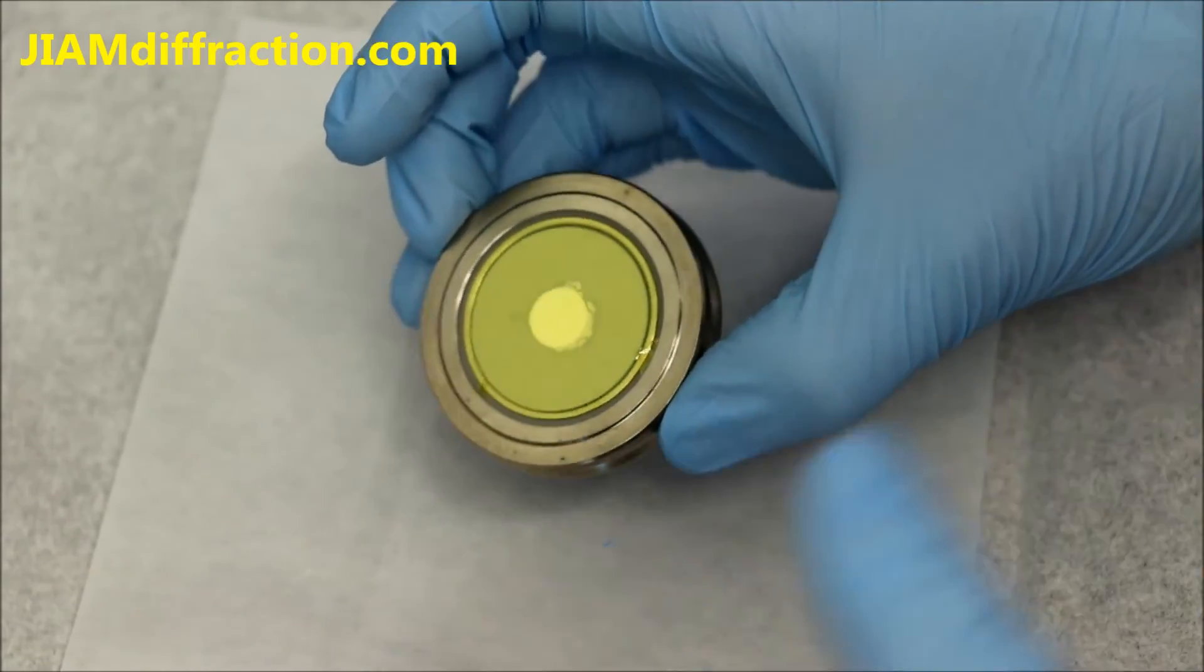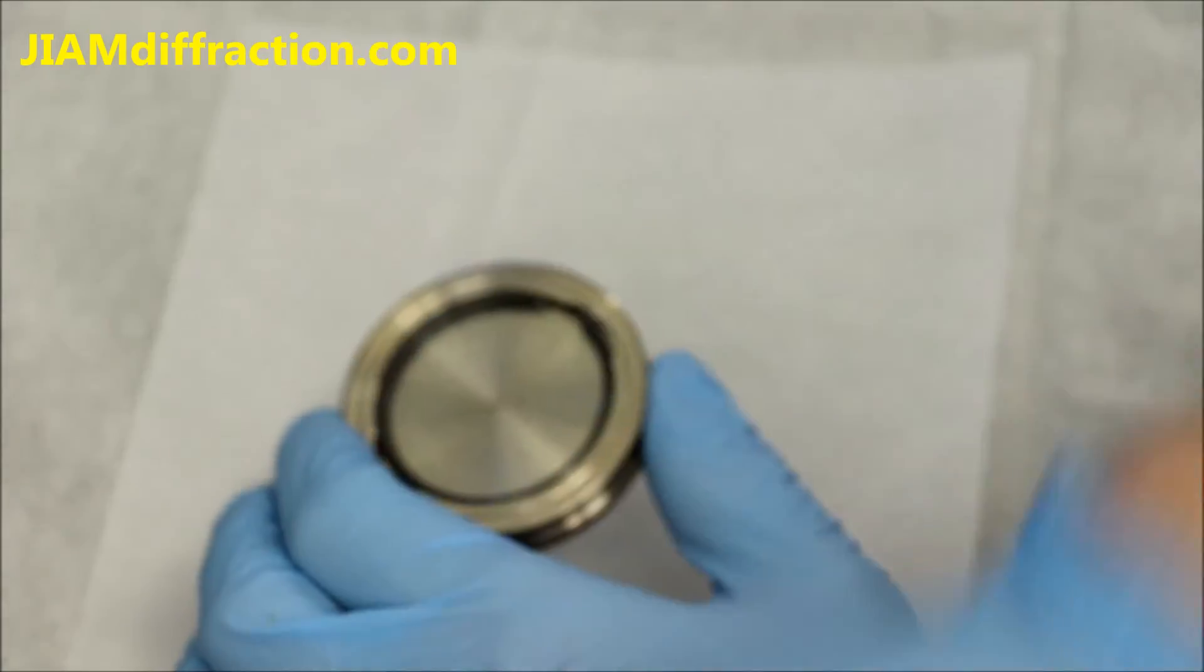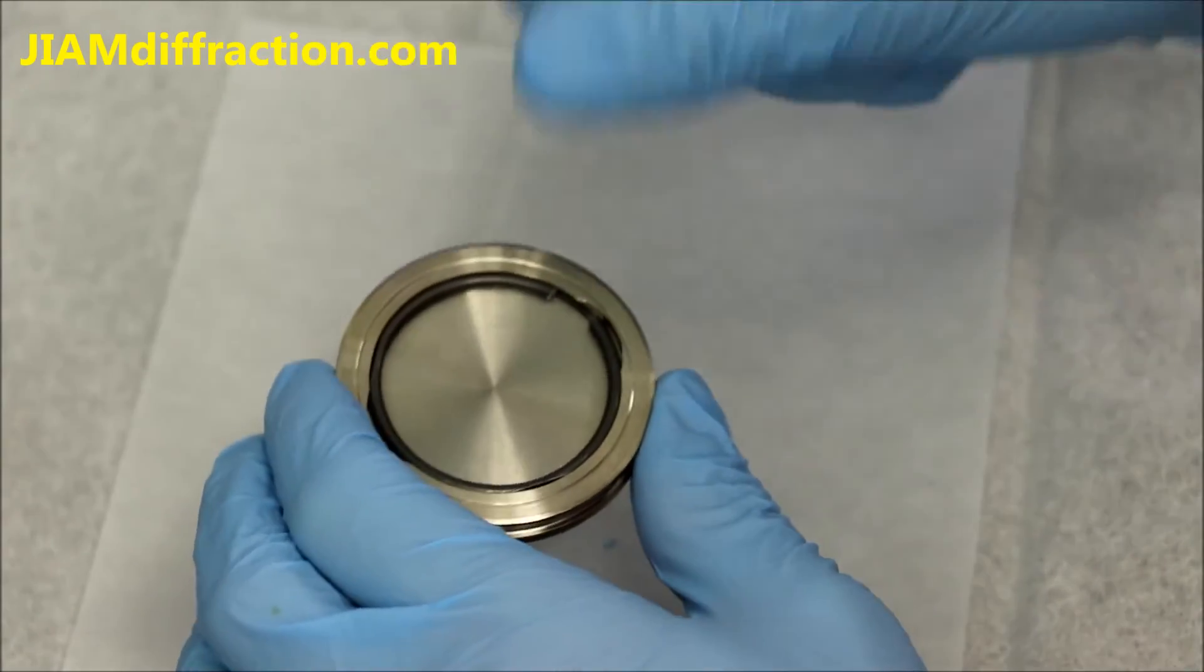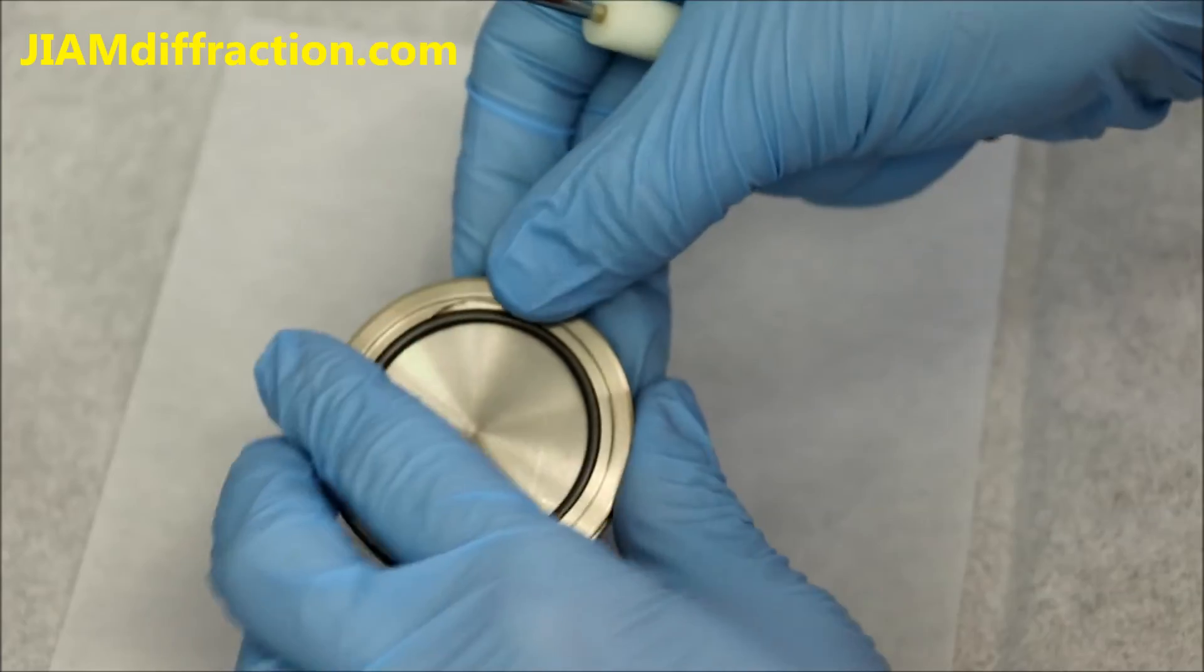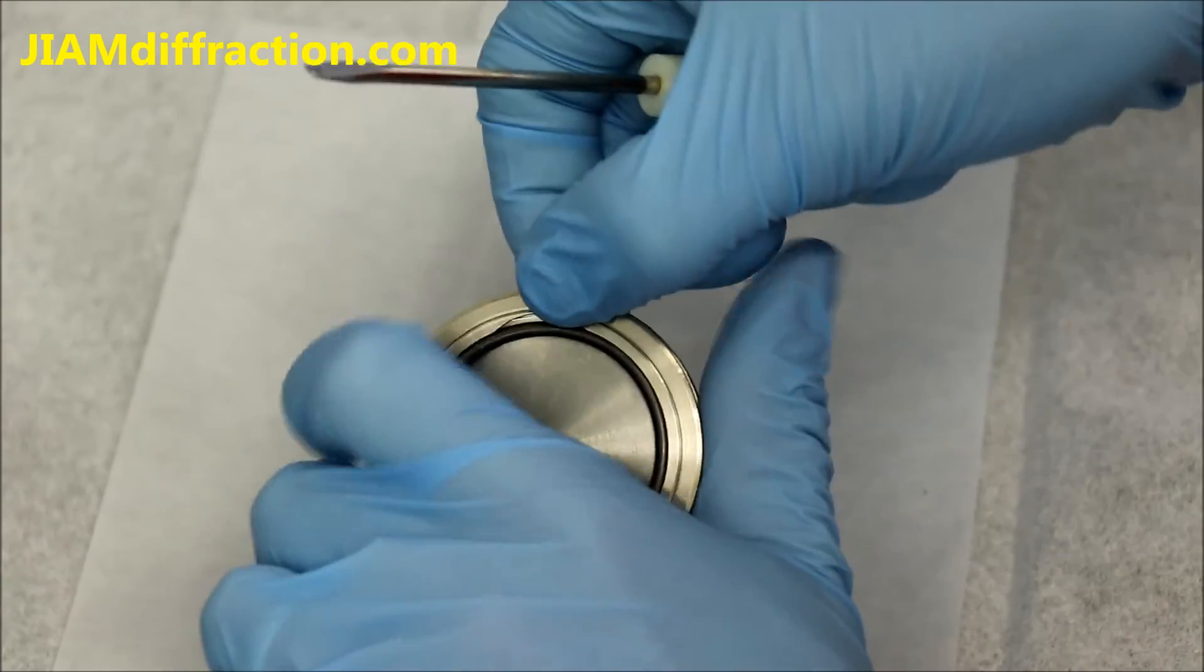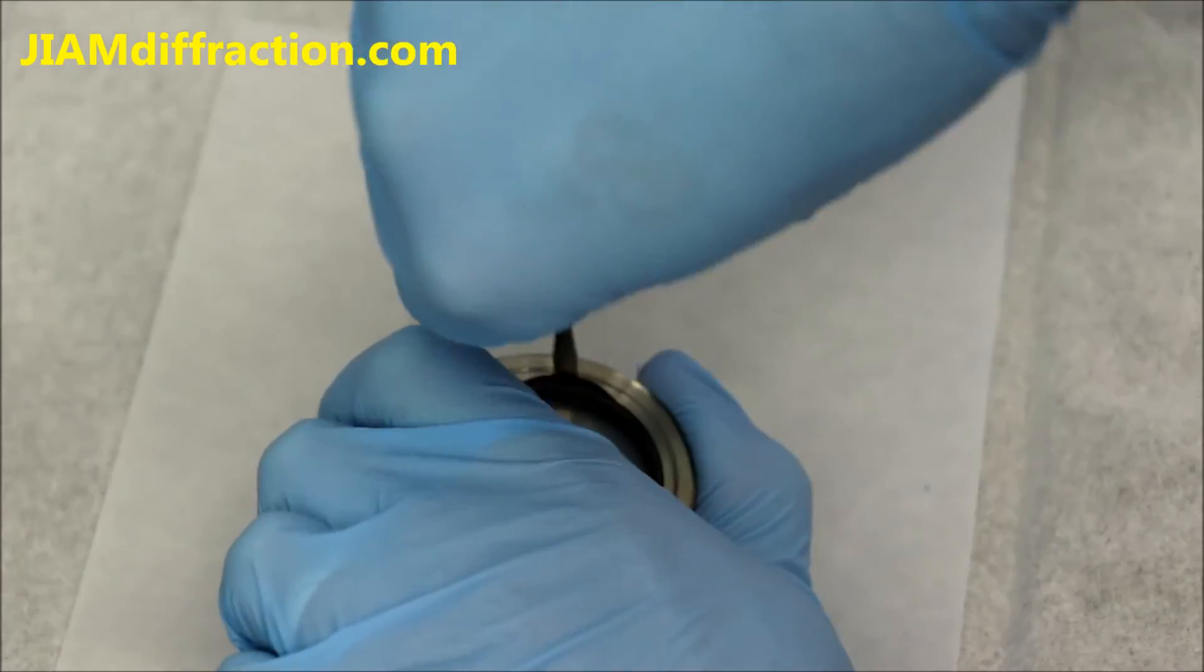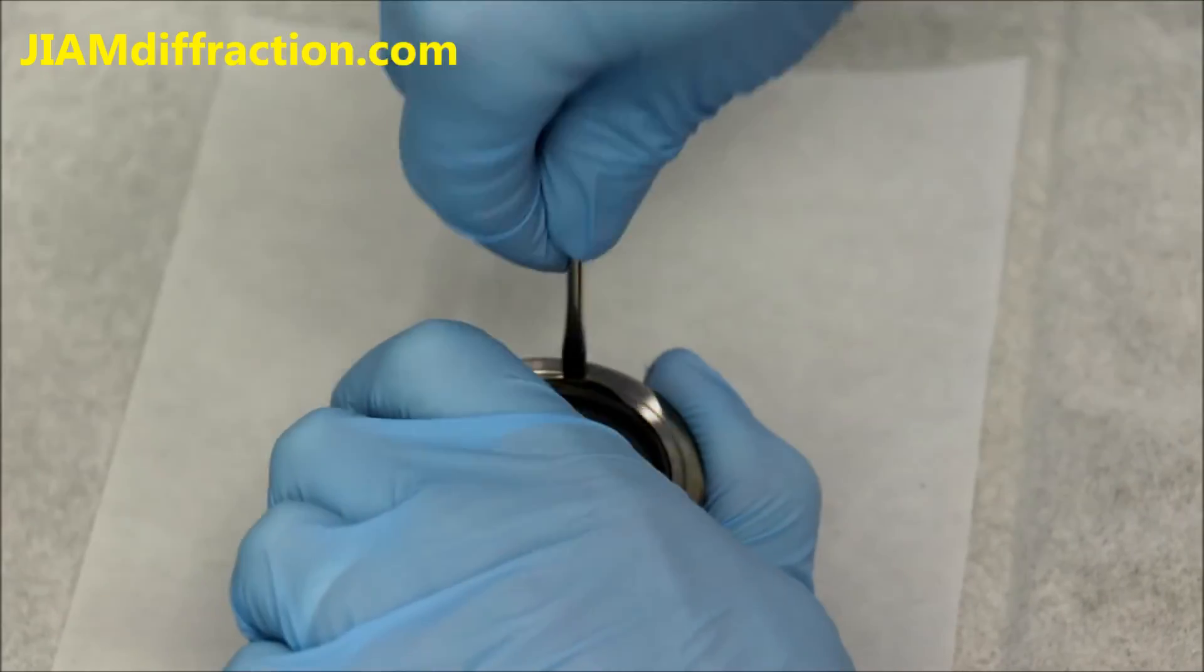Now if you want to take the sample out, typically I just use a small screwdriver and just try and wedge it in there and pry out the ring.